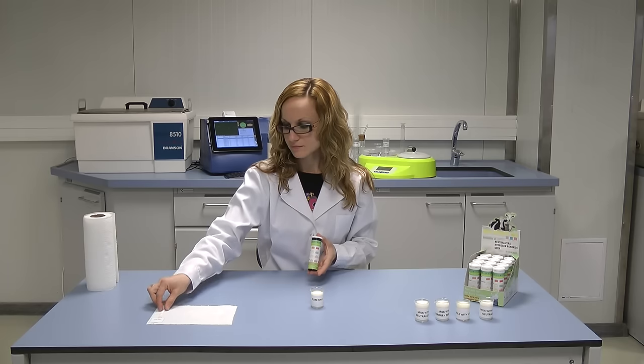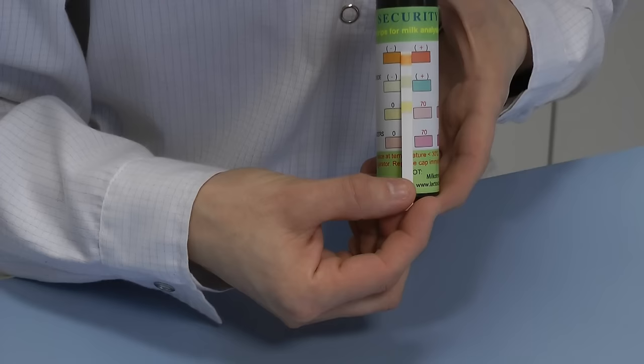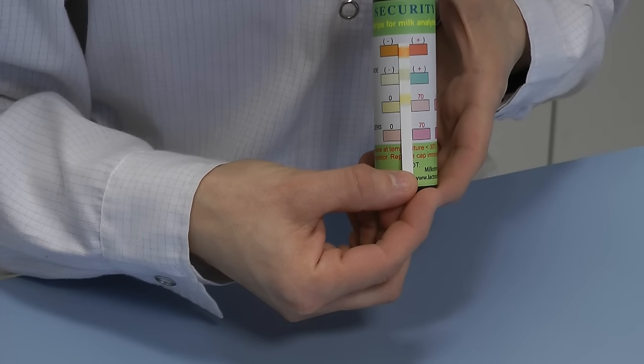Compare the color of the test strip with the color scale on the label. When there is no adulteration, the indication zone is not changing in color.